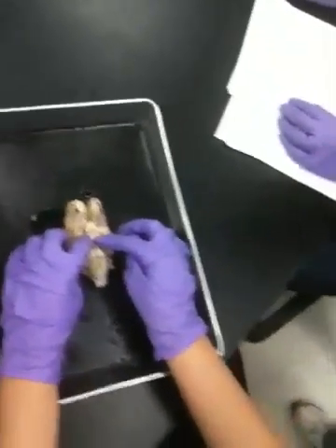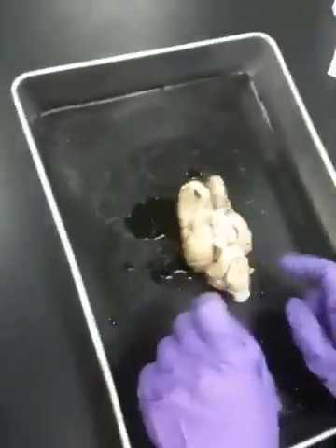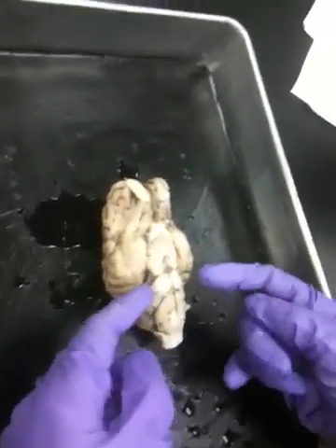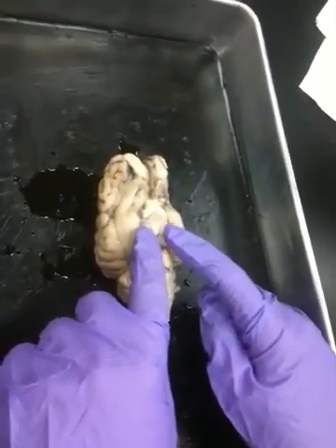The upper part of our brain. So this is midbrain. Pons. Pons is these pods that stick off the front. Medulla oblongata. So this is the pons. This guy. So midbrain.